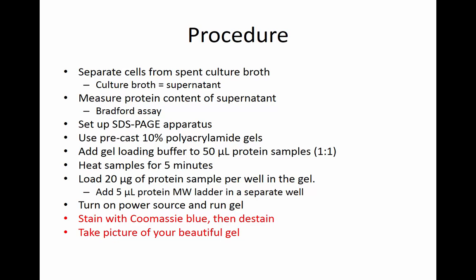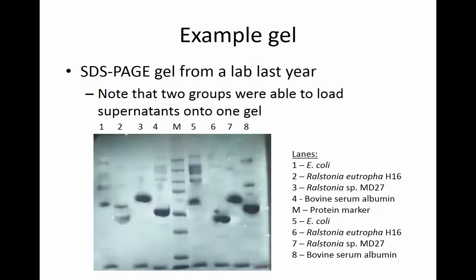Hopefully you'll be able to get all of this done in the time allotted in lab, and there will be an awful lot of waiting as the gel runs. Then you could do some homework or what have you and come back later. But if you do run out of time and you have to go to a different class, lab's over, your TA might need to help you with this. Depending on time constraints, Jayashri can enlighten you as you do the lab that particular day. Hopefully we can get it all done, but just in case, we have a fallback position.